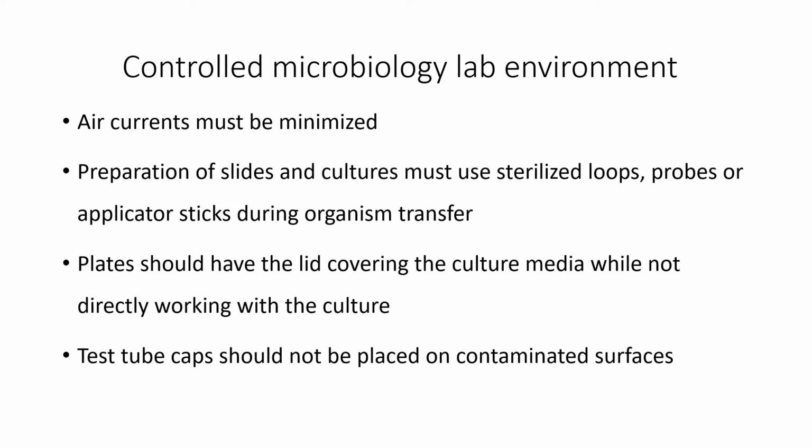Plates should have the lid covering the culture media while not working directly with the culture. So you want to learn the proper way to hold plates, tubes, lids, and caps. Test tube caps should not be placed on contaminated surfaces, but instead should be placed in such a way that they're not becoming contaminated.